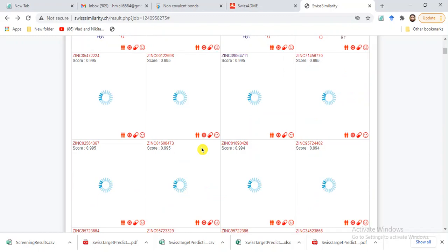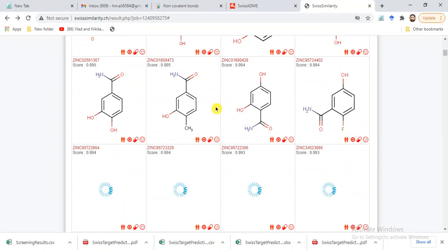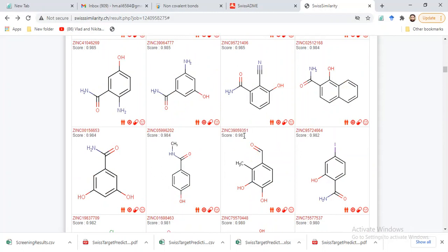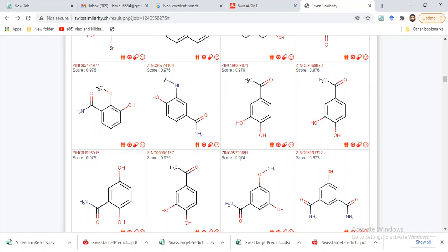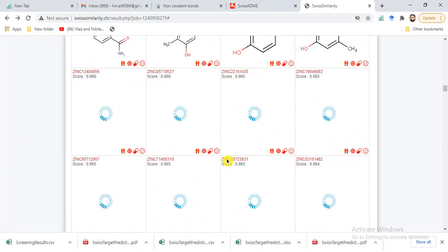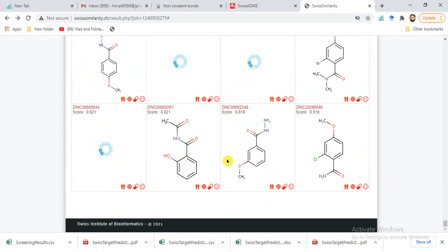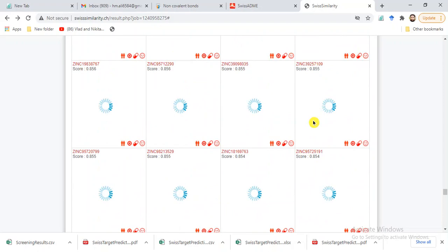Going back to the full list, the similarity scores are decreasing: 0.983, 0.982, 0.974, 0.968, and towards the end it reaches 0.818. So it gives all similar compounds ranked by similarity to our query compound. We can save this results file as a CSV file.